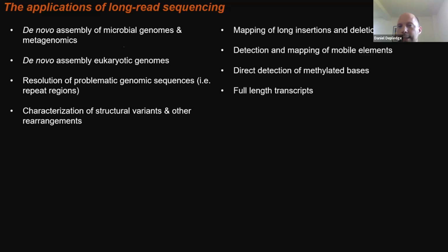And this then extends to the mapping of long insertions or deletions, and the detection and mapping of mobile elements that you may find. And perhaps most excitingly, at least from my point of view, the idea of doing direct detection of methylated bases, or indeed any base that carries some kind of modification.